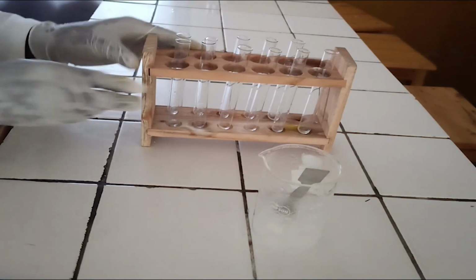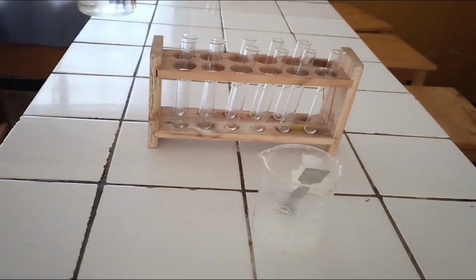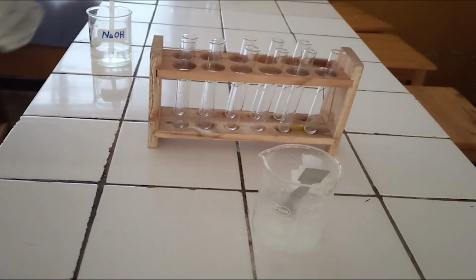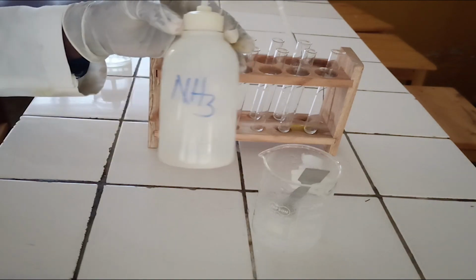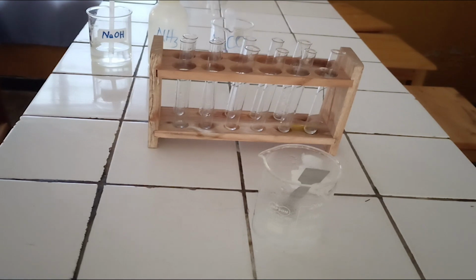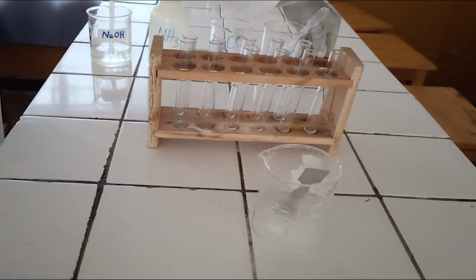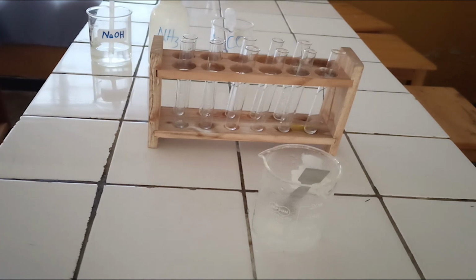Chemicals required: 1. Sodium hydroxide solution. 2. Diluted ammonia. 3. Sodium carbonate solution. 4. Solid ammonium chloride. 5. Disodium hydrogen phosphate.